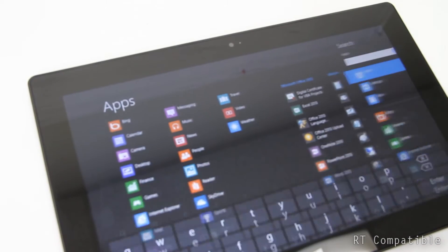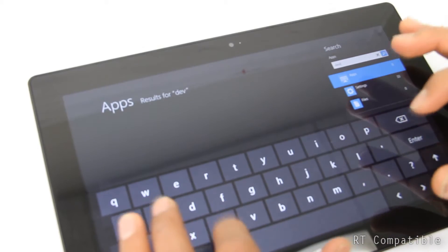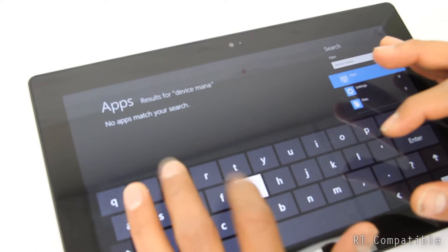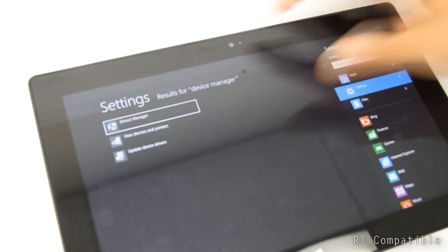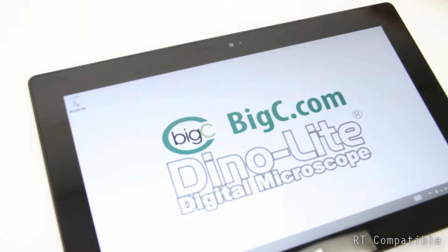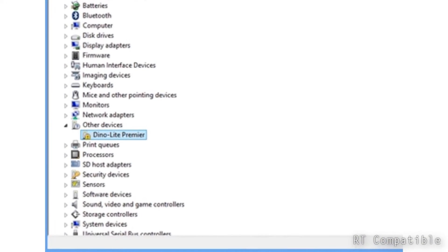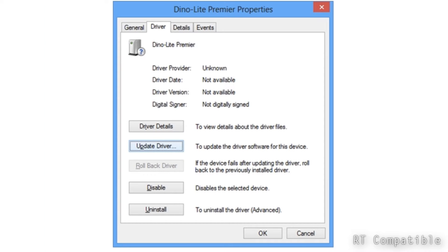After connecting the USB, open the Device Manager, select the Dynolite from the list, and choose Update Driver.